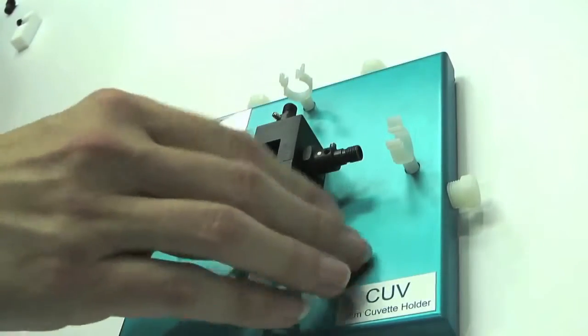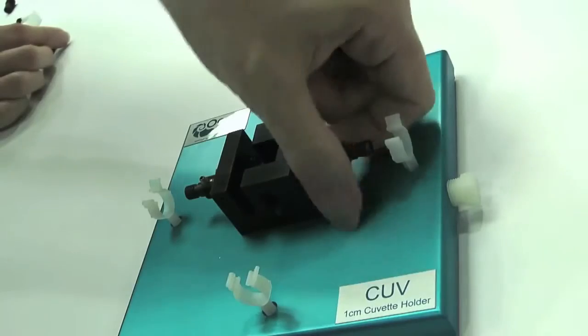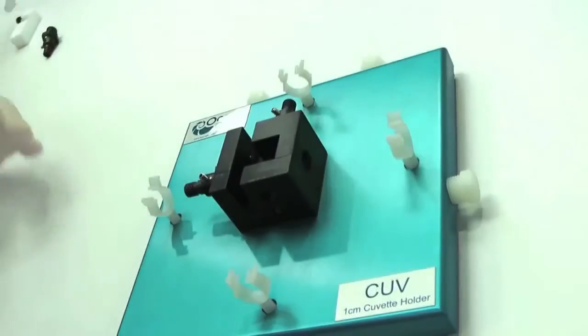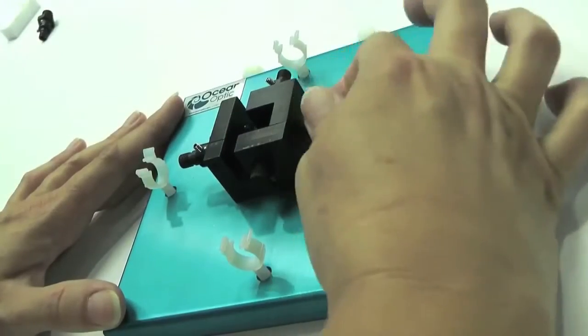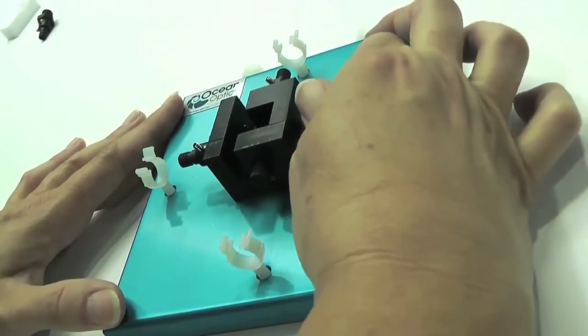Using your CUV cuvette holder you can replace two of the 74 UV lenses with the two mirrored screw plugs provided, which reflect light back through the sample in order to enhance the fluorescent signal.